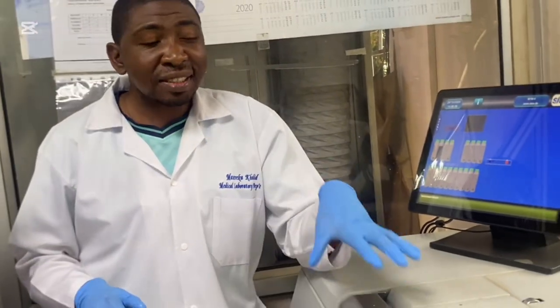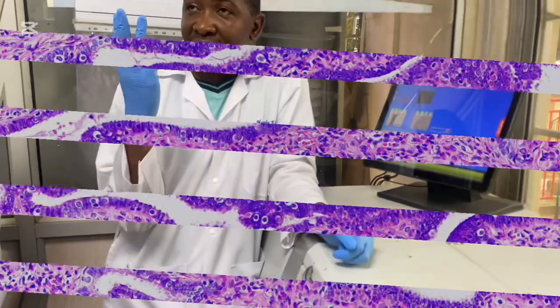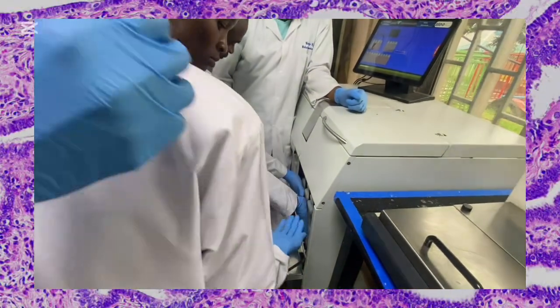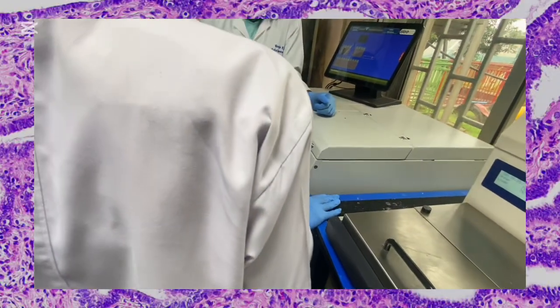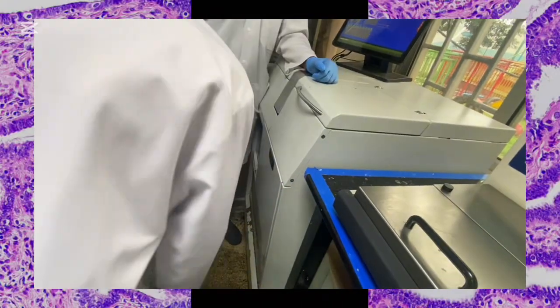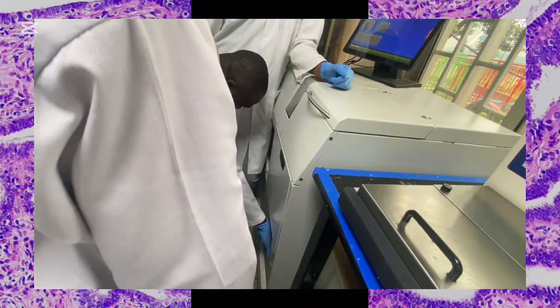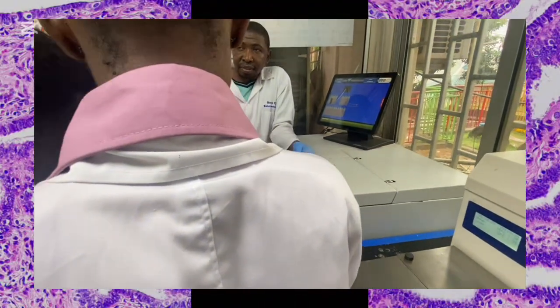However, with this modern machine, the enhanced heat exchanger is applied on dehydration and clearing, capable of warming up reagents during their transfer to the specimen processing chamber. Heating these reagents to 55 to 60 degrees centigrade allows faster processes, especially for very small biopsies.